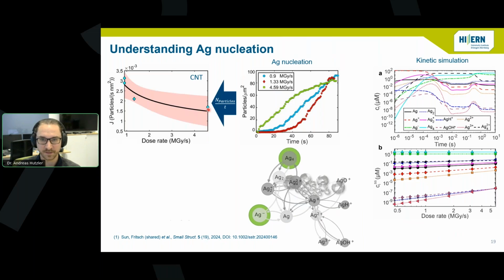So basically the size of more or less one atom is already the critical radius, and also the solubility predicted by the model of elemental silver species was very high, and reduced silver species basically don't have any solubility, so they are mostly insoluble. So this model did not work.